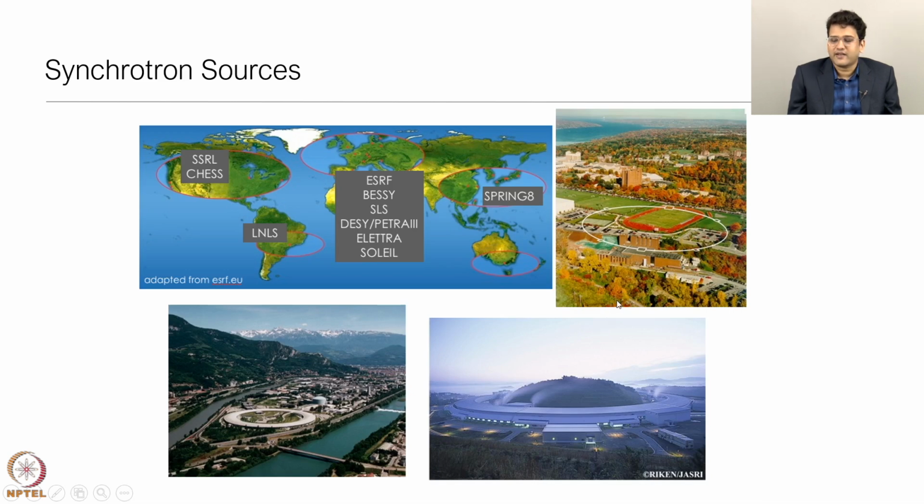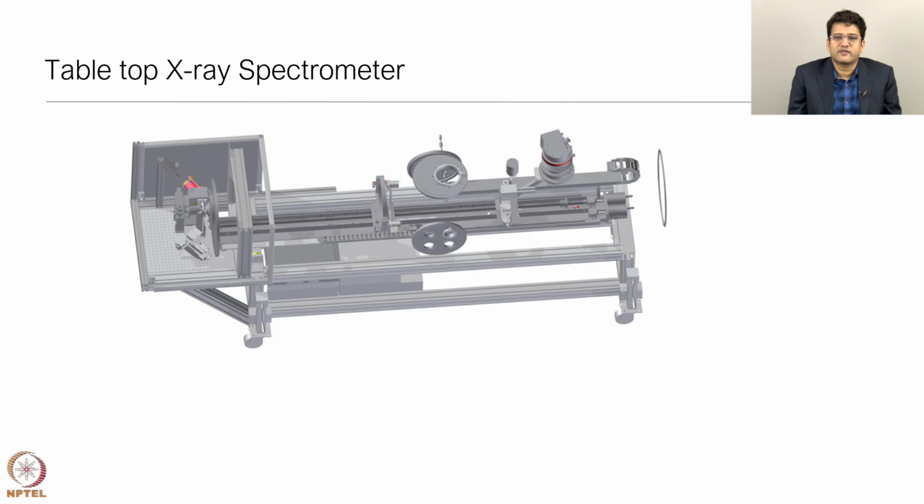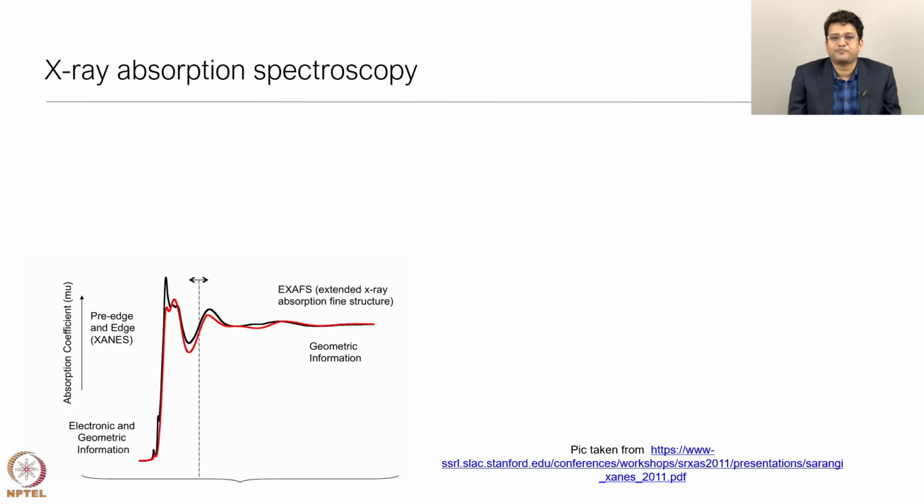But in the present day, you can also have tabletop instruments. This is an X-ray emission spectrometer. Radiation sources which are portable and easy to set up are becoming more and more common these days. So, X-ray spectroscopy is becoming more and more important in the present time.